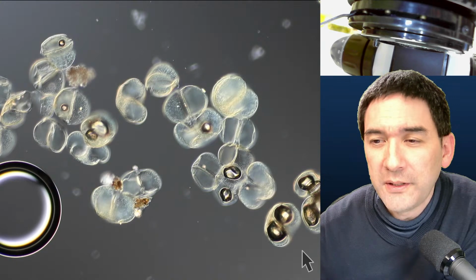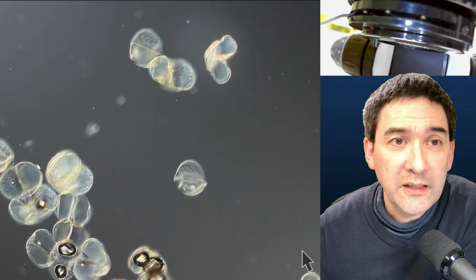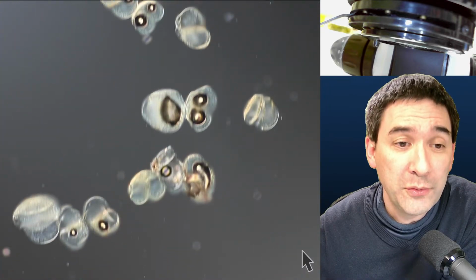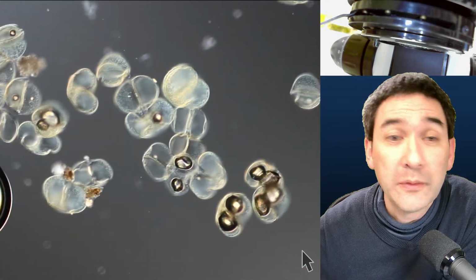So yes, a comment: I'll soon have the opportunity to get Entellan as a mounting medium. Do you have any experience with it? No, unfortunately not. I know that Entellan seems to be a very popular mounting medium, but I do not have any experience with it. I would be happy if you could report back.